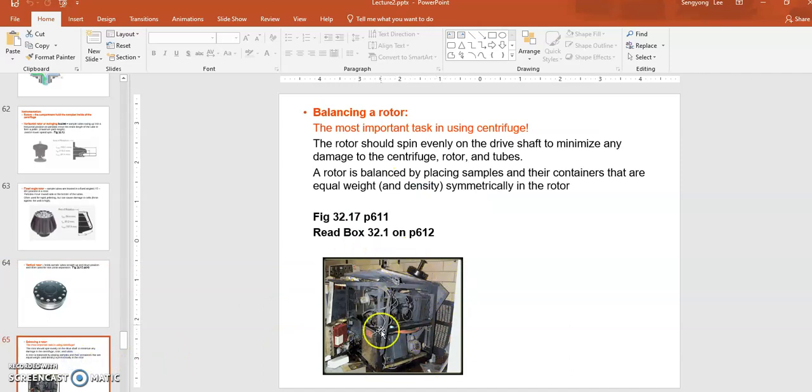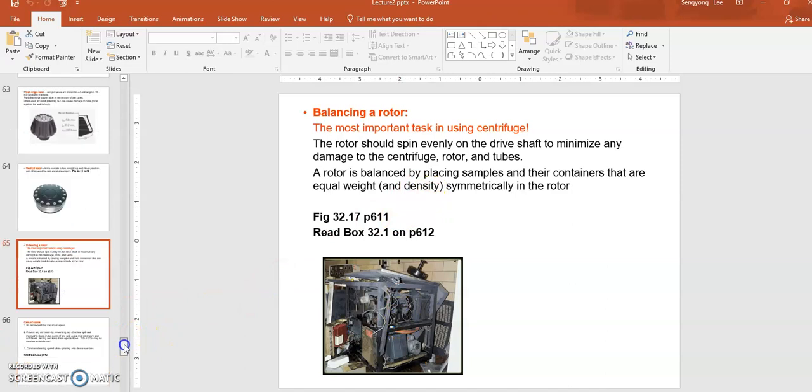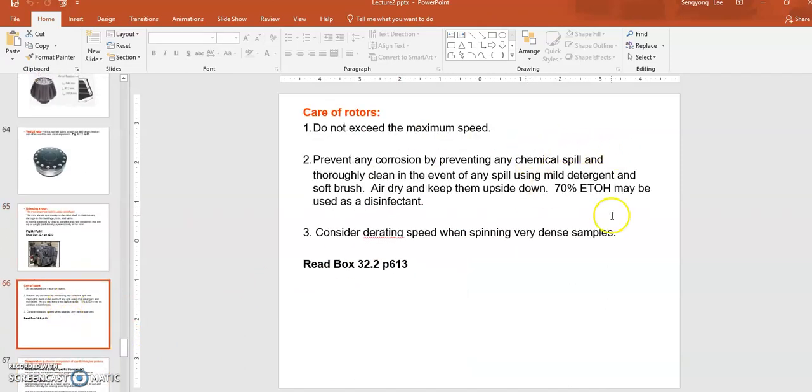This used to be a centrifuge, but since somebody loaded the sample without balancing it, during the ultracentrifuge operation the entire rotor was damaged under the very high centrifuge condition. This could create an environment where people can be seriously hurt, so you definitely do not want to make this kind of error. Make sure you balance. Counterbalancing is very important before your centrifugation operation.